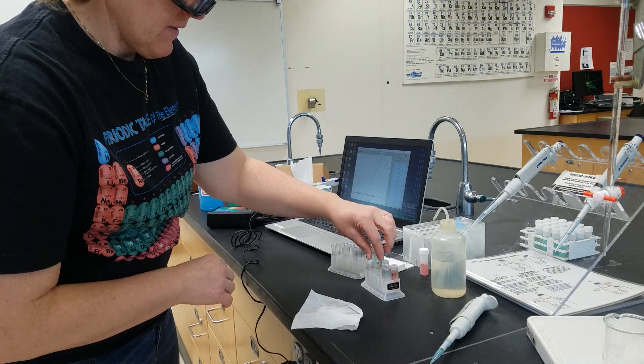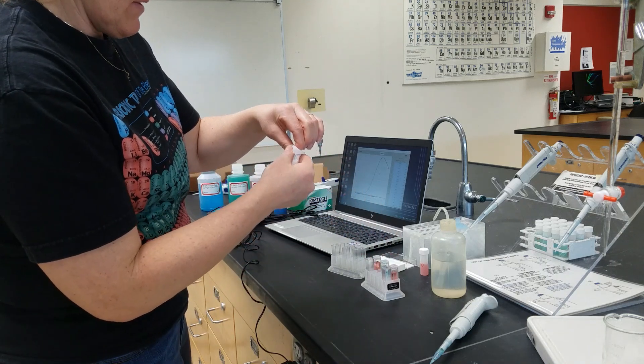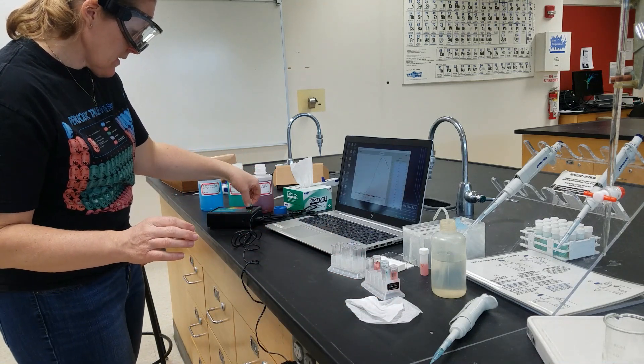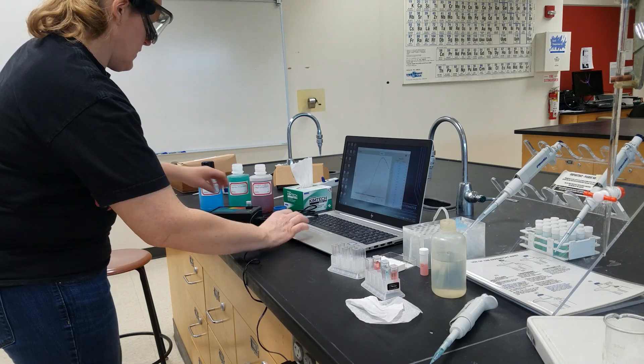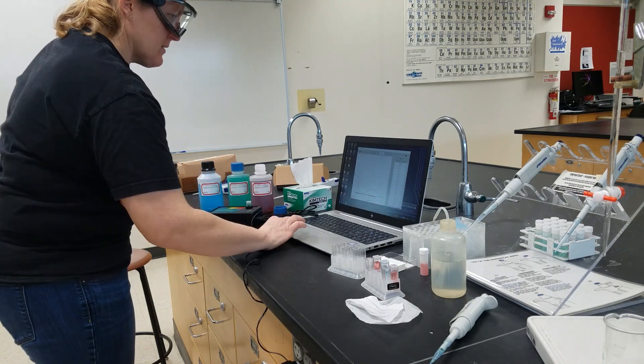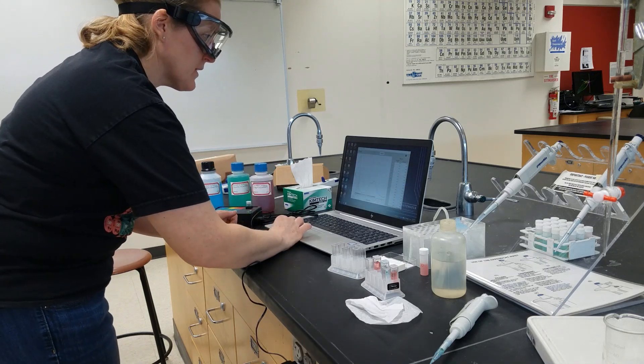Finally, the last known solution. We're going to take the nickel, place it into the spectrophotometer, and hit collect. And stop. And rename this data set.